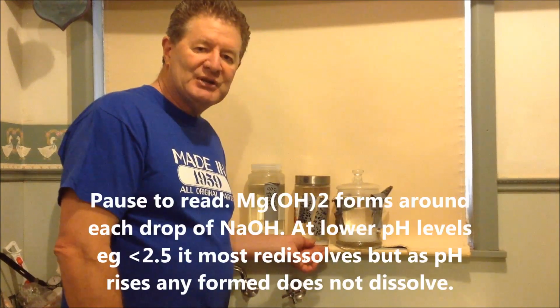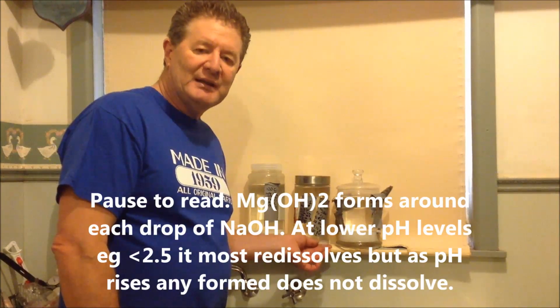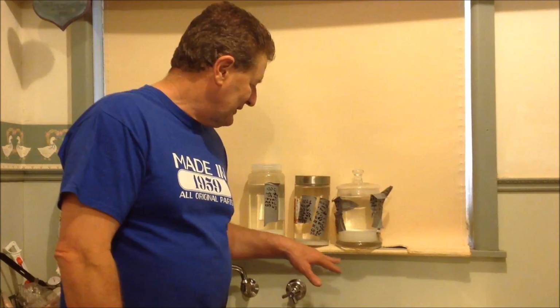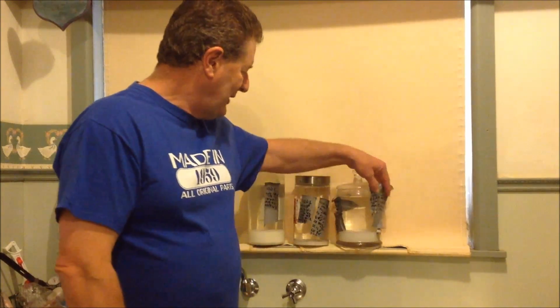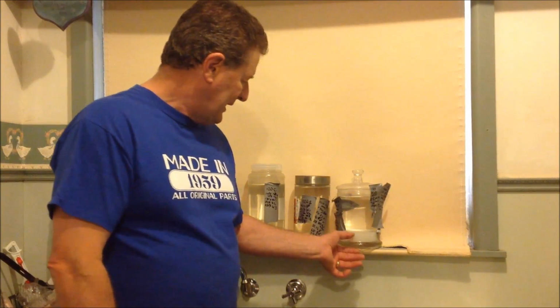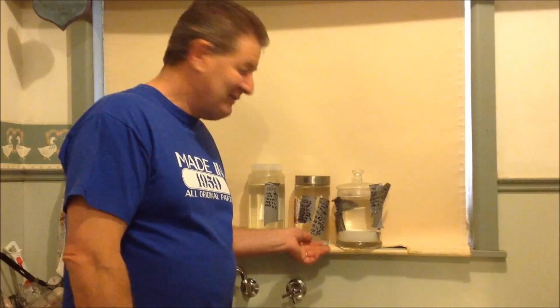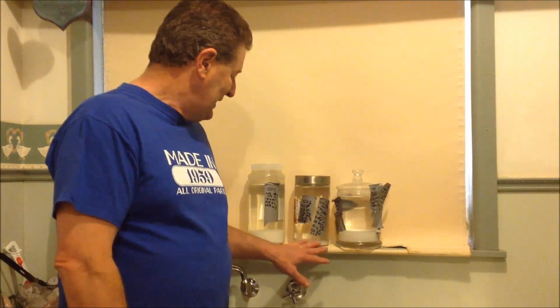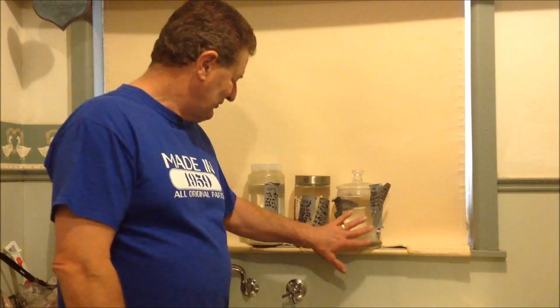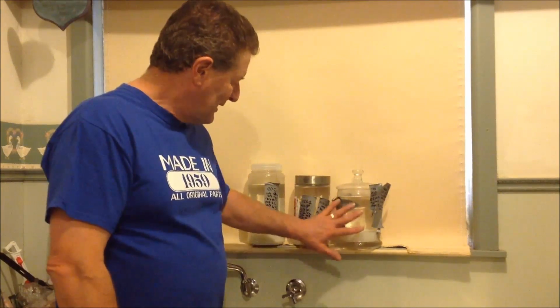But it's begun to emerge that even though you're not going above pH of 9, it is still mostly magnesium hydroxide. This one went haywire. You can see all the extra tags on there. That's because the experiment went haywire, and these were originally timed to finish about the same time, which happened to be in May, believe it or not, after having started well earlier in the year. And now it's December, so this experiment went haywire, and these have been sitting there washed since May, and it's now December, and I've just finished this one.